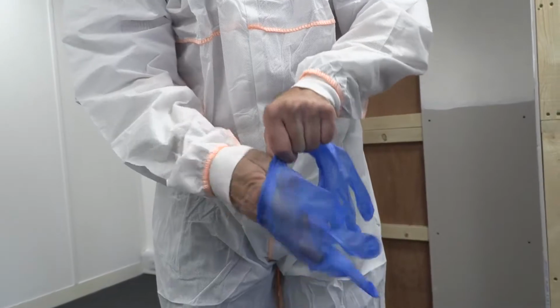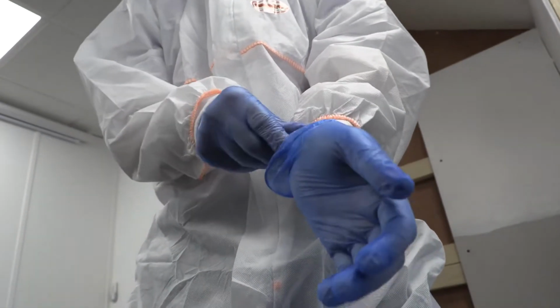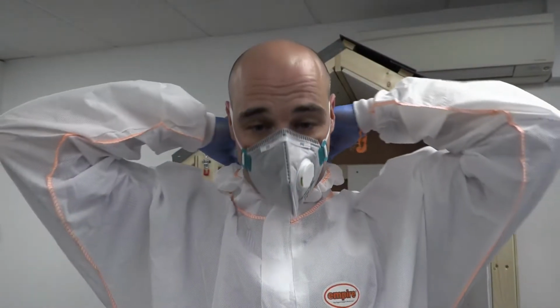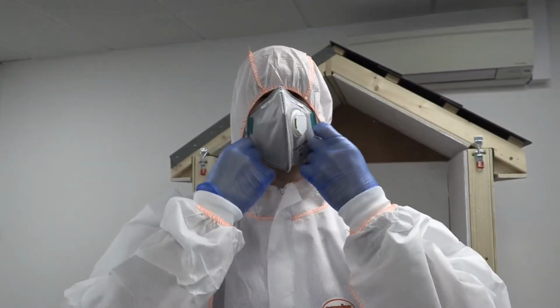Put on the gloves and pull the suit sleeves over the wrists to create a really tight fit. Finally, pull the hood up over your head, ensuring all hair is covered. When all previous steps are completed, you'll be ready to take your first sample.